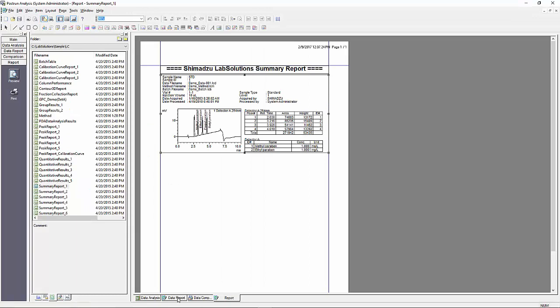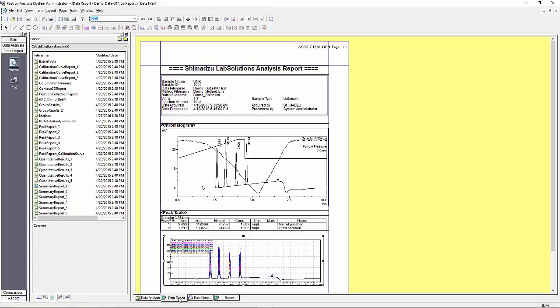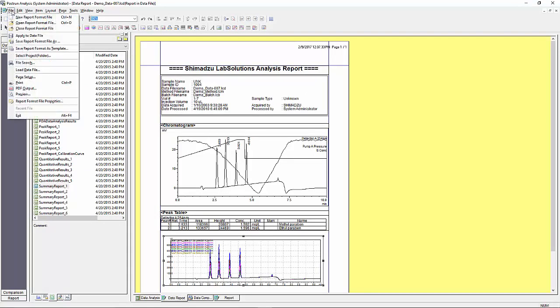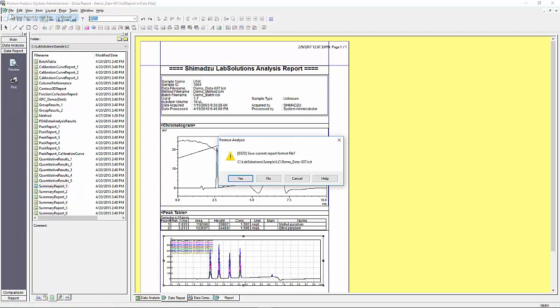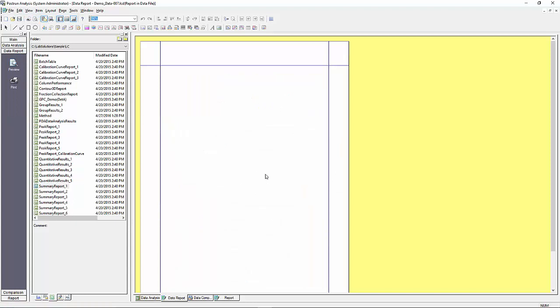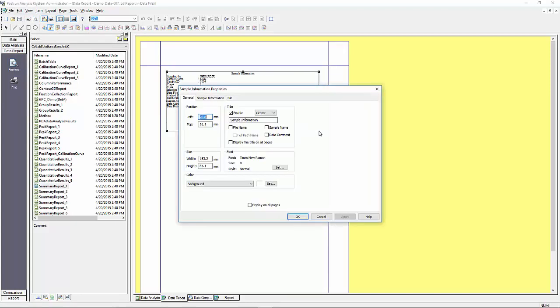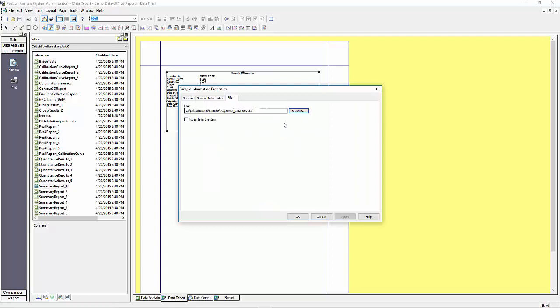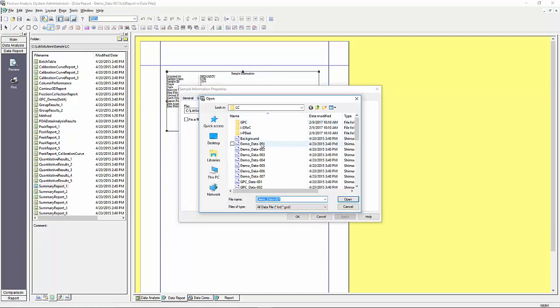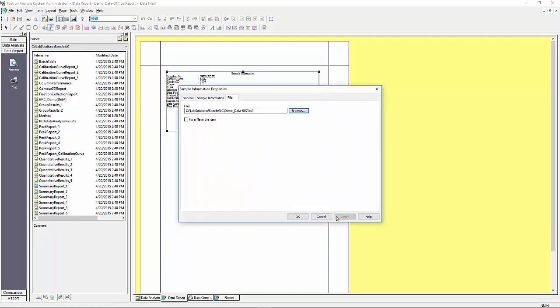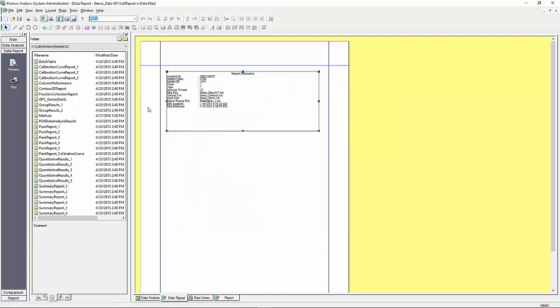If you would like to create an entire report format or template from scratch you can also do that. Go to file and then select new report format file. This will provide you a blank page in the editor for you to start building your own custom report. As mentioned previously, when creating your report, once the item you want to insert is selected, drag and drop a box in the report where you want that item to be displayed.